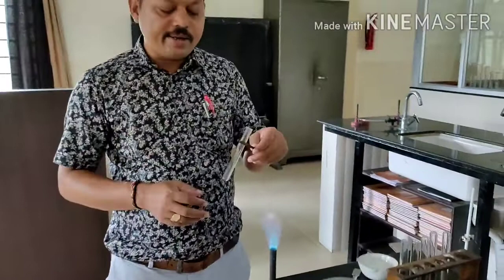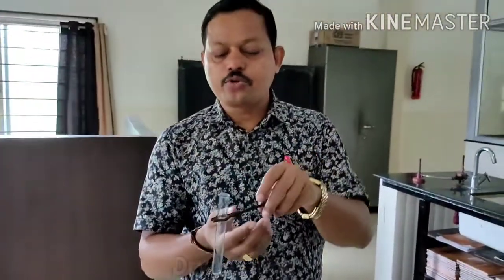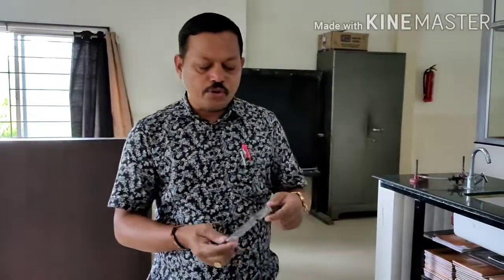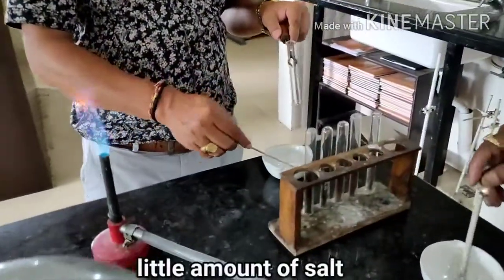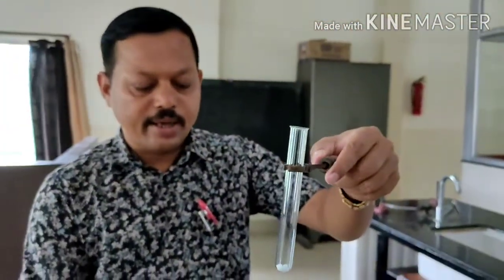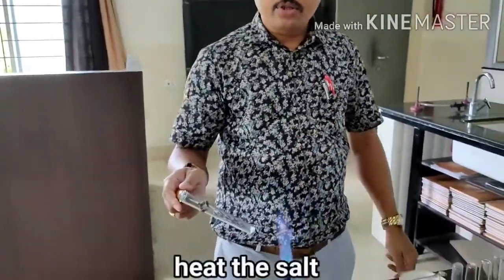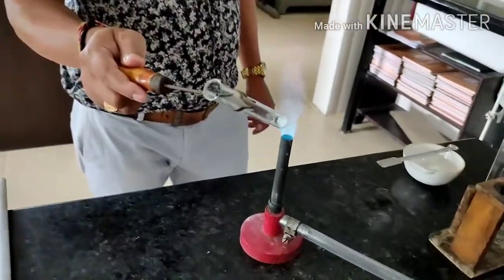Heating in a dry test tube means you have to take one dry test tube and use one test tube holder. Since these are dry tests, the test tube should be dried. In this dry test tube, you take a little amount of salt — whatever salt you will get. After taking the salt, you directly heat the salt. This is called heating in a dry test tube.